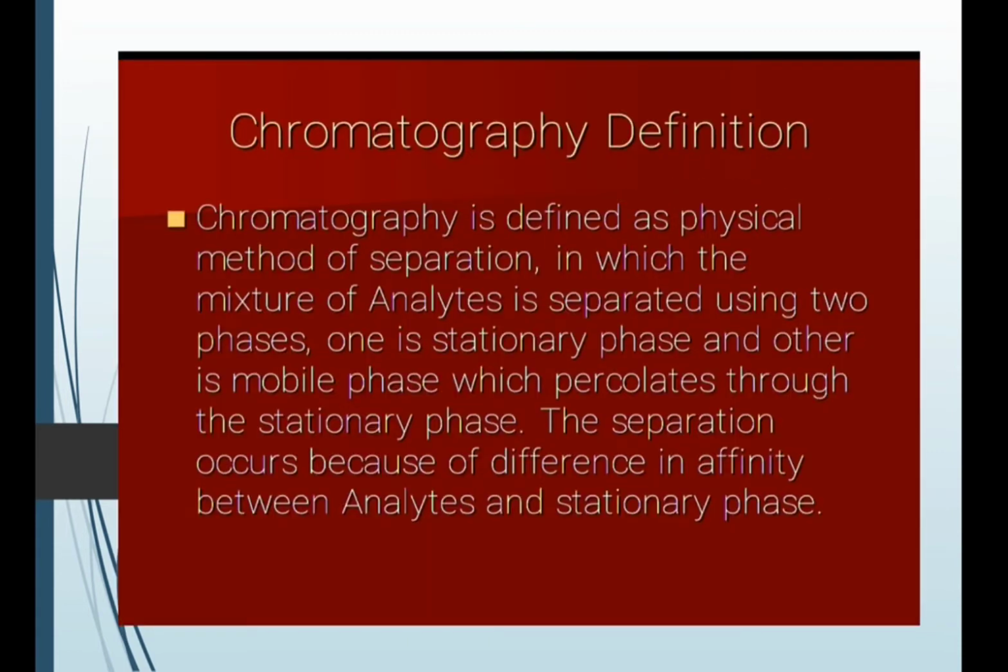Firstly, here is the definition of chromatography. Chromatography is defined as the physical method of separation in which the mixture of analytes is separated using two phases. One of them is the stationary phase and the other one is the mobile phase, which percolates through the stationary phase. The separation occurs because of the difference in the affinity between analytes and the stationary phase.